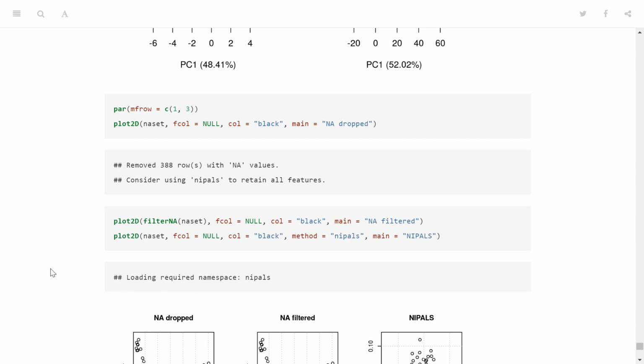So it tells you that it automatically removes 388 proteins that have one or more missing values. Now, if we use MSnSets, we can also do something like that manually with the filterNA function. So these two will have the same result in terms of visualization. Here, the missing values are removed automatically. Maybe I wasn't aware that I had missing values, and here I do it manually.